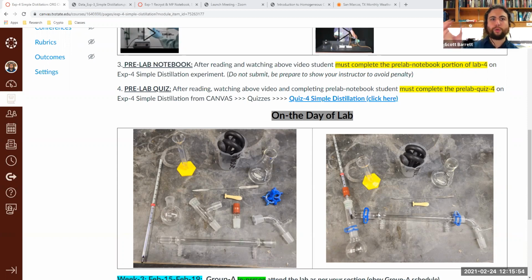So what happens is the cool water comes up the bottom of the condenser and then comes out of here. The cool water is coming up and the heat is transferring into the cool water and coming out of the condenser down into the sink or your area to remove the water that you'll be pushing through the condenser.